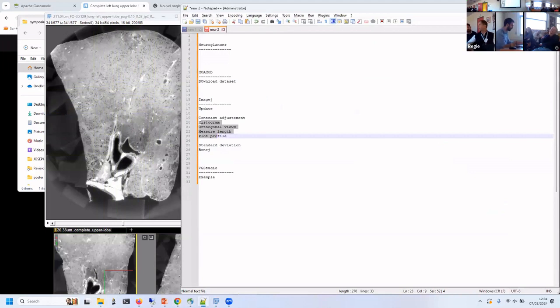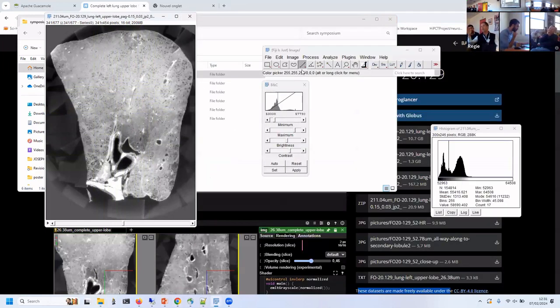I think a trick for everyone is to use a massively heavy bin. Just try it first, figure out what you really need, and then open a higher resolution. Exactly. ImageJ is for that: a quick assessment of your data set, and you can do quick things. After, if you want to go into deeper analysis, you can use higher-level software, or you can use Python if you want to automatize everything. But yes, it's a very powerful tool.